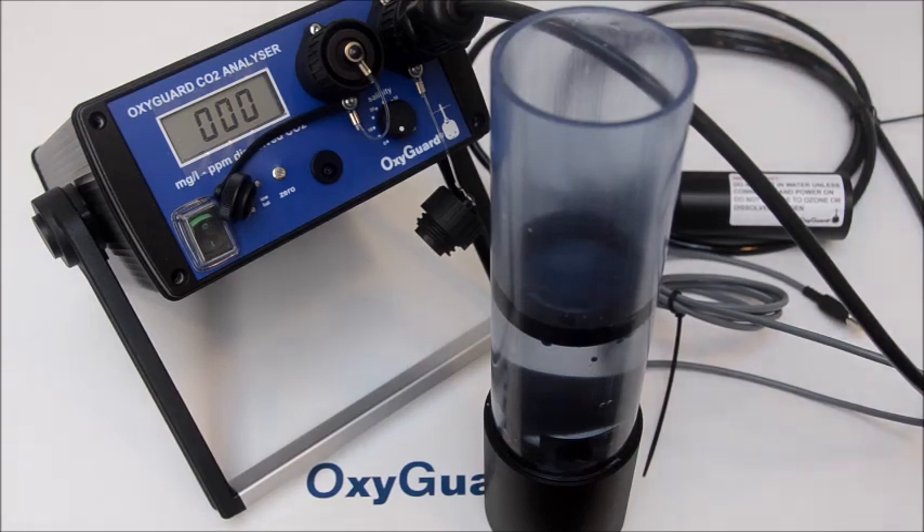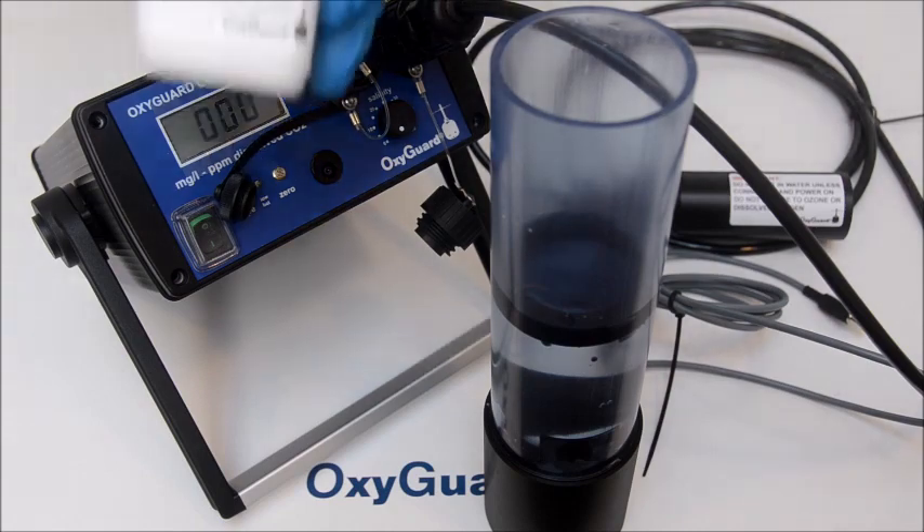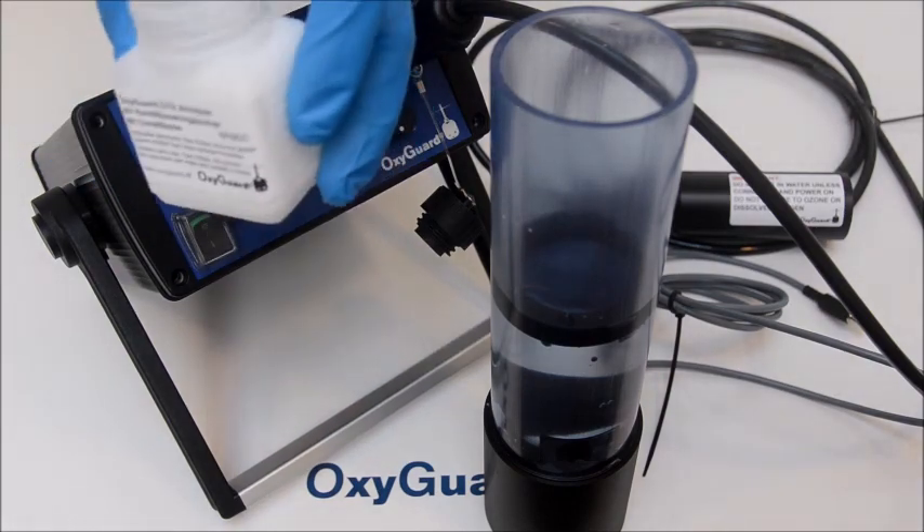Add one measuring spoon of pH conditioner. Stir until the powder has dissolved.